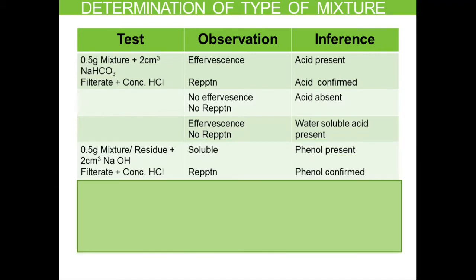We then proceed to the next test. Since one component is detected, what remains will be called a residue. The residue must always be washed before proceeding. Since an acid was present, we need to remove any traces of it. Hence, we wash this residue with sodium bicarbonate and then with water to remove any remaining reagents.